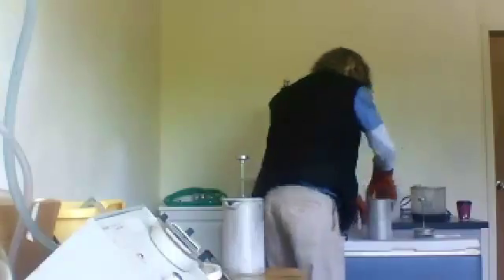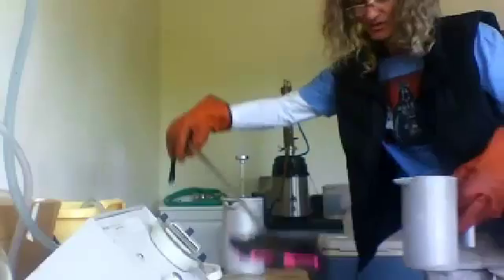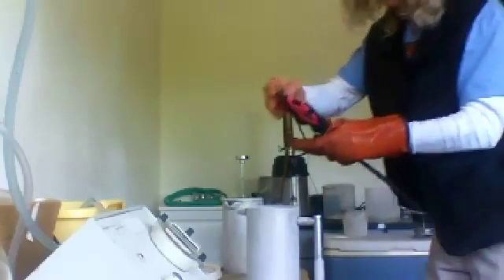Okay, now I showed you before. I hope I can see this. Actually, I'm going to do a selfie here because I poured liquid nitrogen in here before, and I did that for a reason, and I'll show you why.